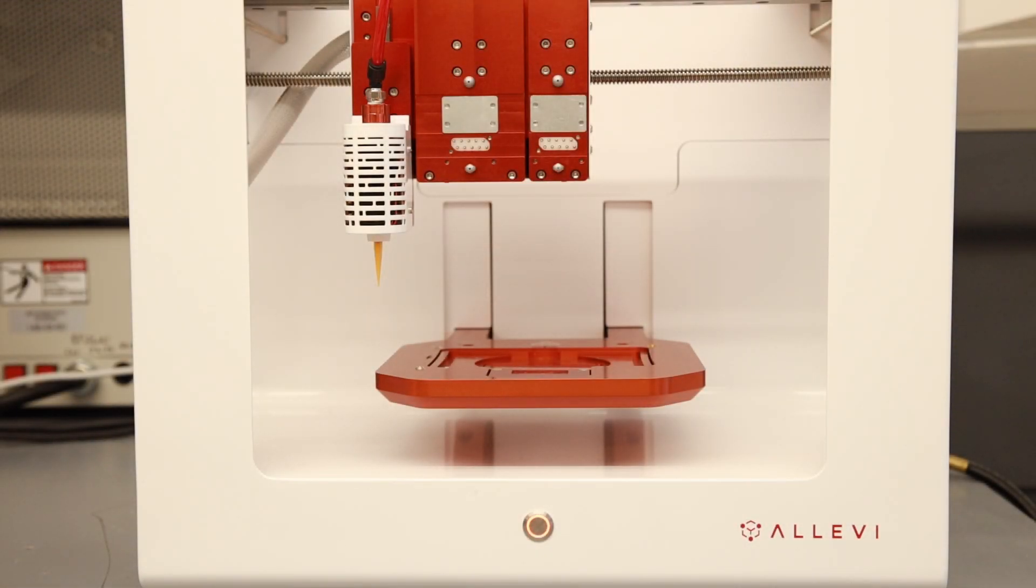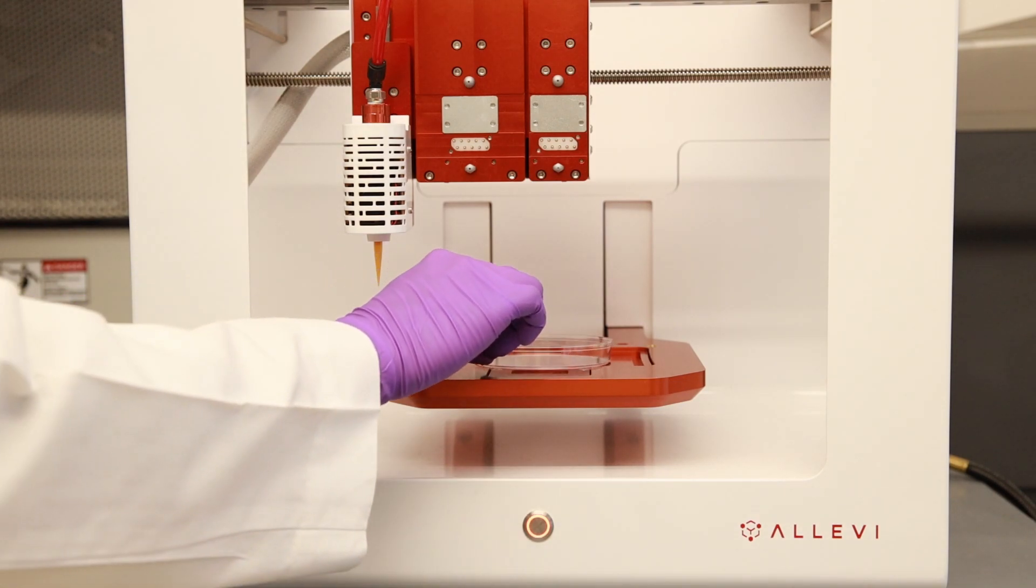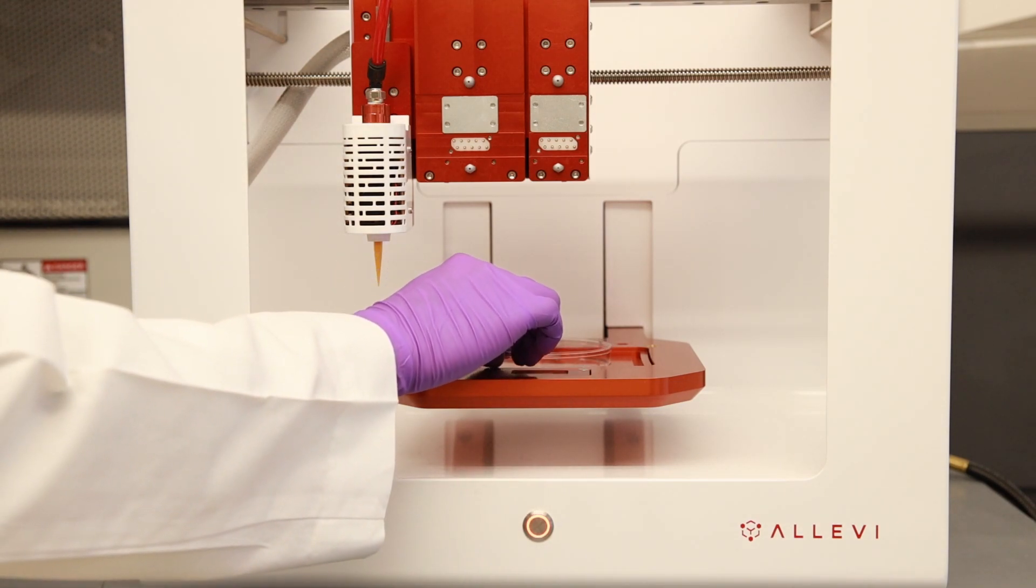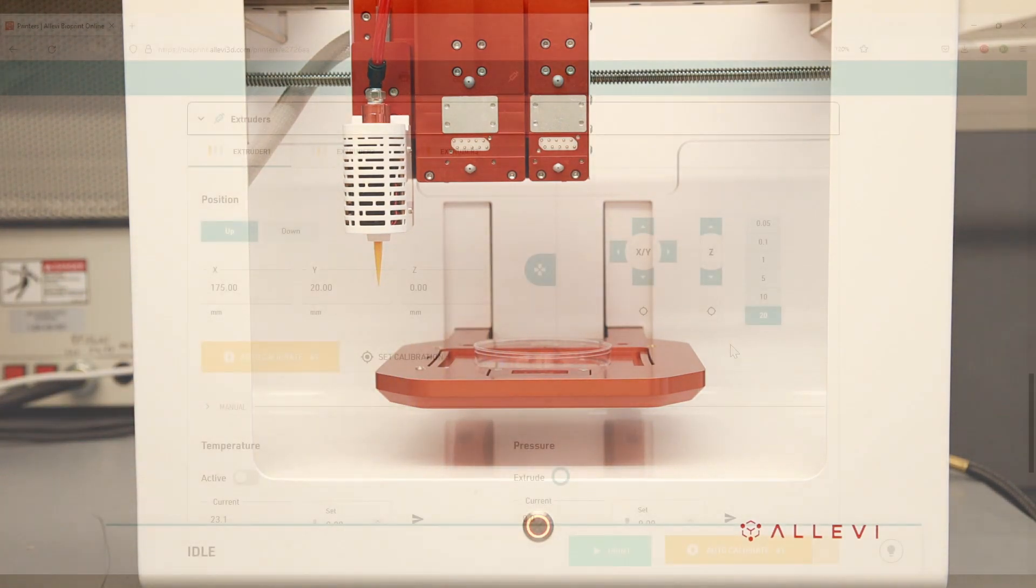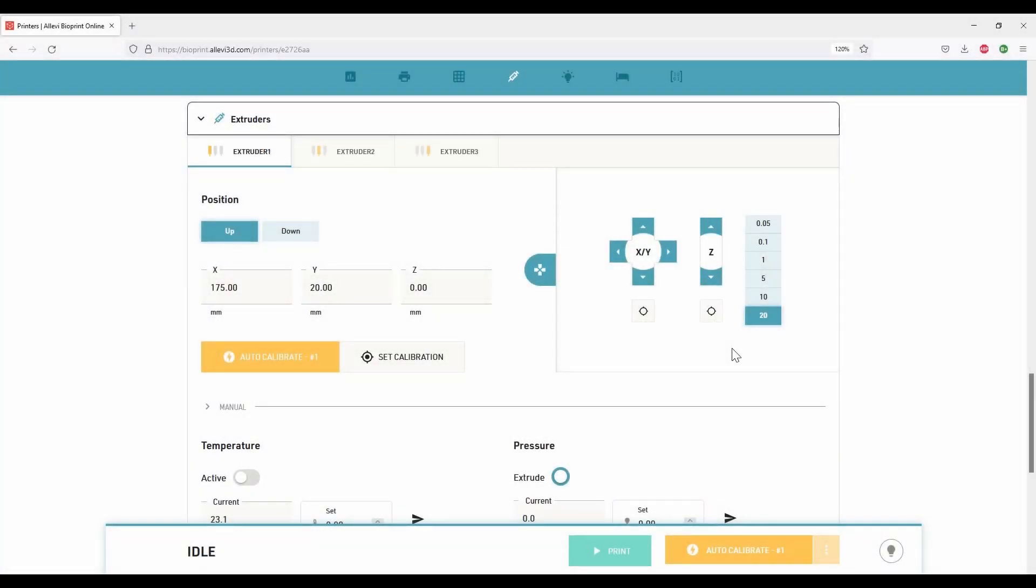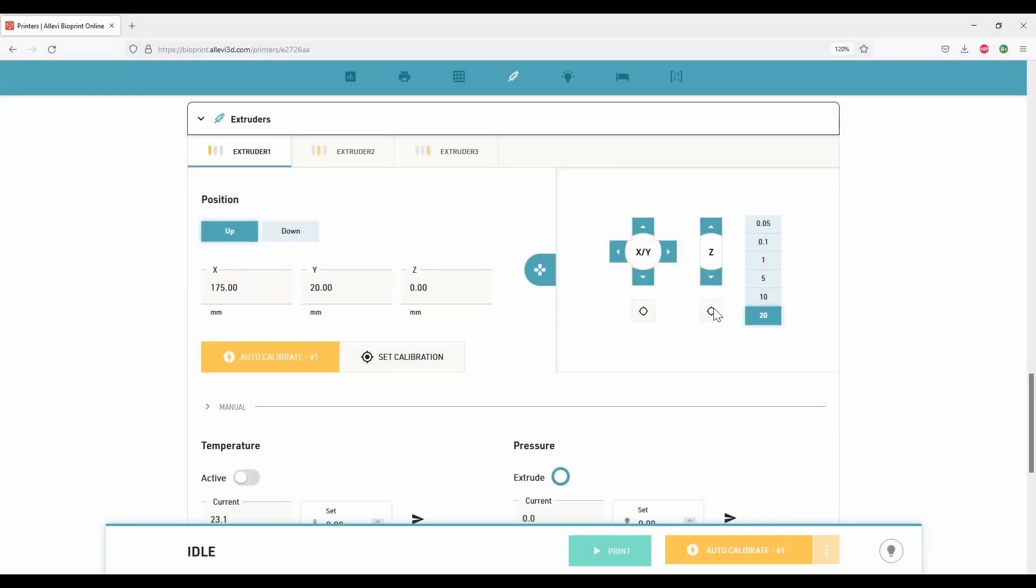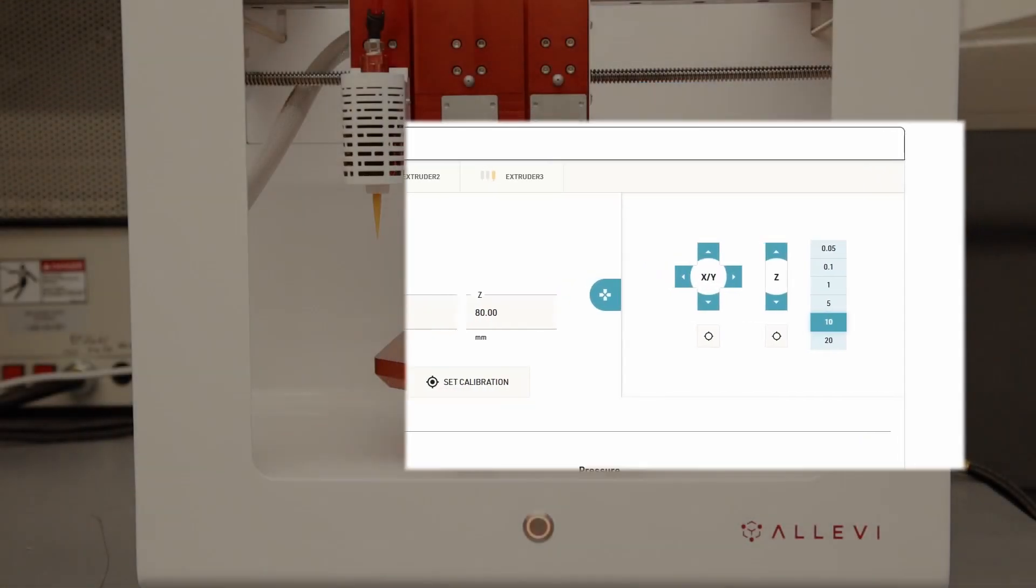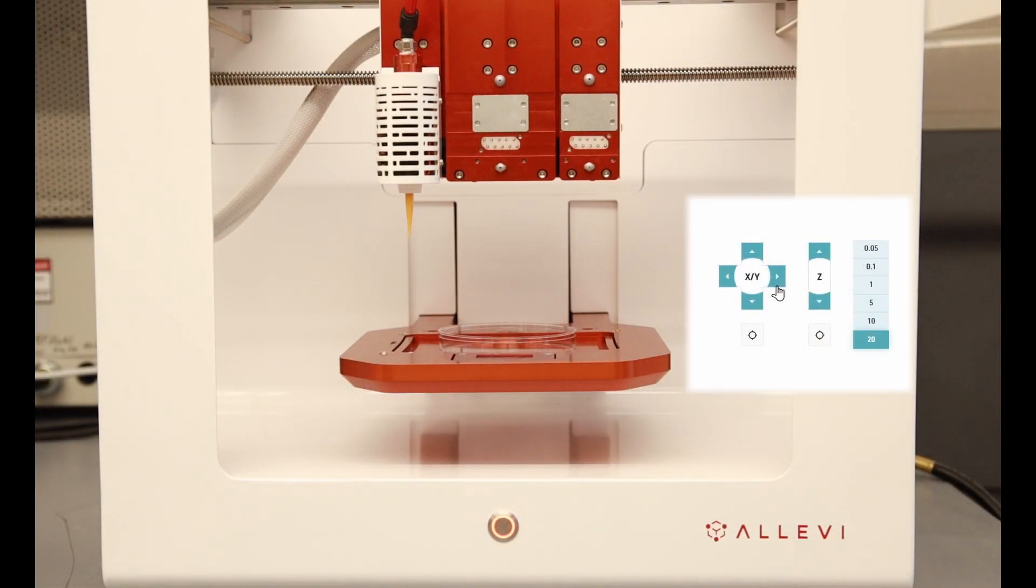Before performing manual calibration, place the desired build surface onto the platform. Using appropriate step sizes, move the extruder.